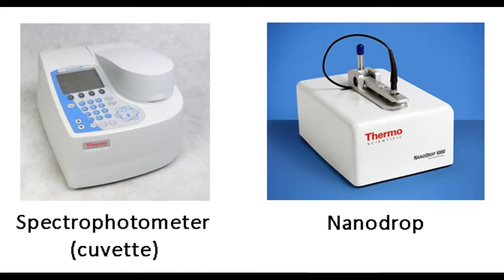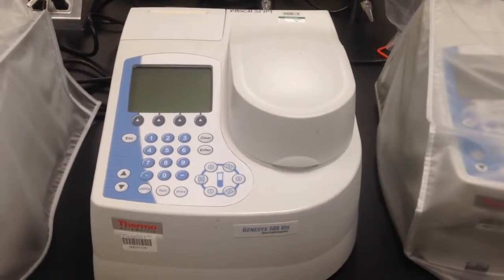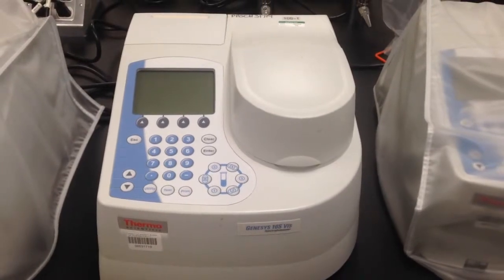Today I will be showing you how to use an old fashioned standard cuvette spectrophotometer and a more modern nanodrop. The difference between the two is that one is able to measure samples of larger volumes and the other one requires a mere few microliters of a sample. So let's go ahead and start with the cuvette spectrophotometer.